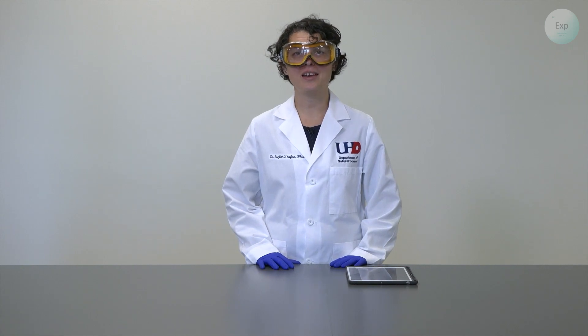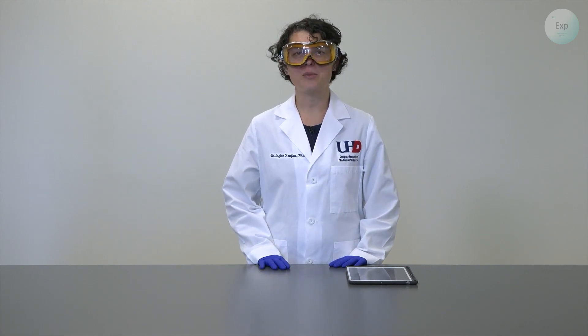Hello, my name is Dr. Esther Trufan, and today in this video I will demonstrate the titration of a monoprotic weak acid, acetic acid, with sodium hydroxide.